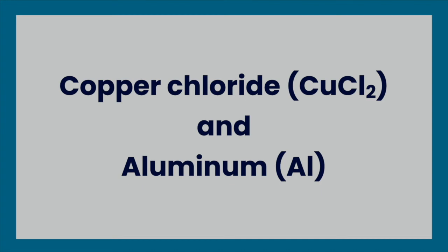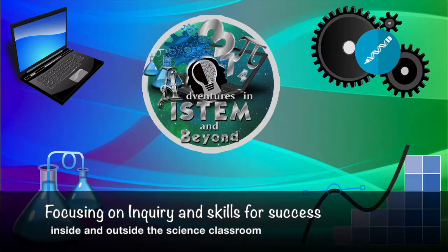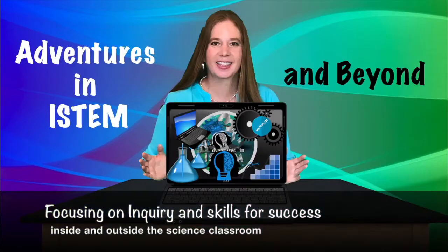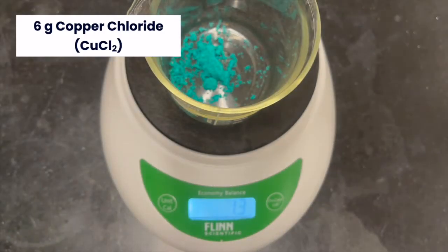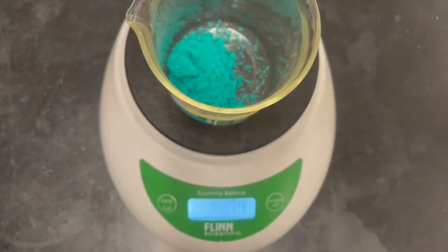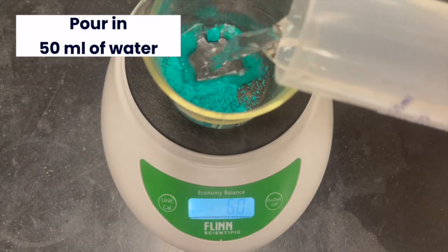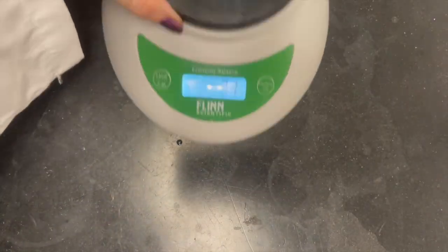Copper Chloride and Aluminum. First, measure out 6 grams of copper chloride. Pour in 50 milliliters of water, then stir it until it is dissolved.